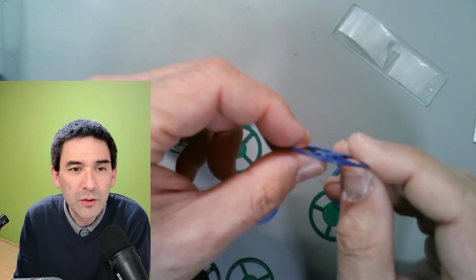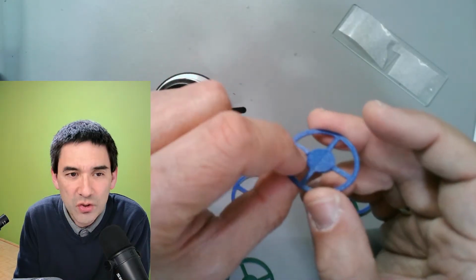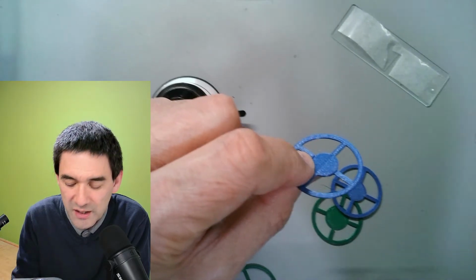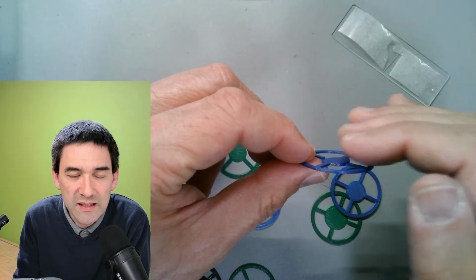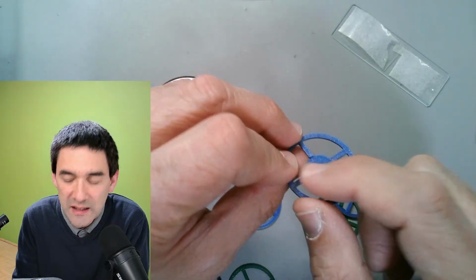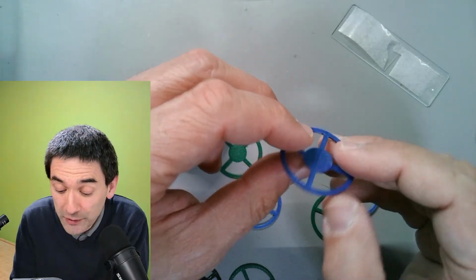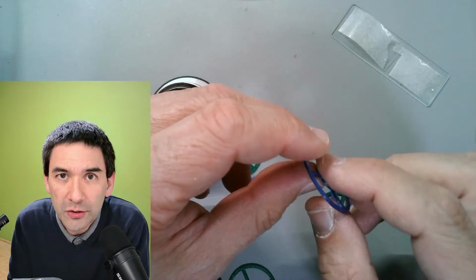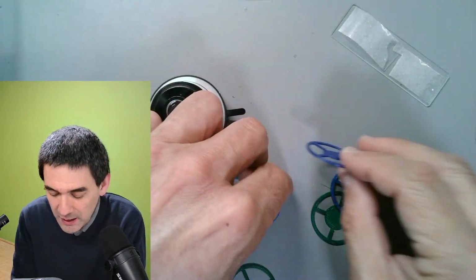I don't know if you're able to see this, but I actually tried to make a thickness gradient. So this side over here is thinner in the center. You have to refocus. This one is thinner in the center than this one over here. So it's slanted, but I found out that it's generally too thick and it completely blocks out the light. So not everything works, and that's one of the reasons why I've been 3D printing those, because it's easy to create a large number of filters for trial and error. That's the only reason.